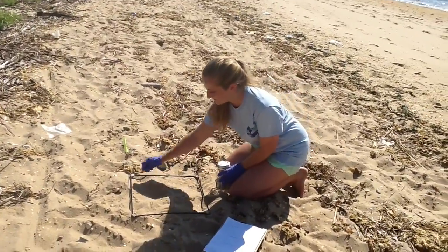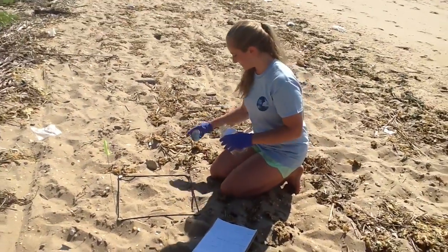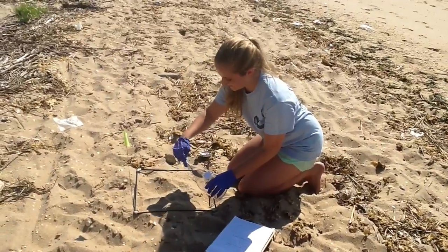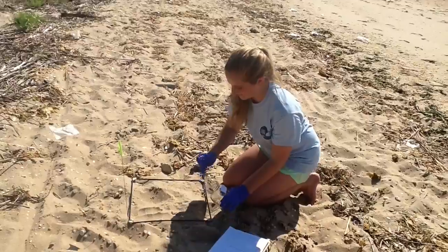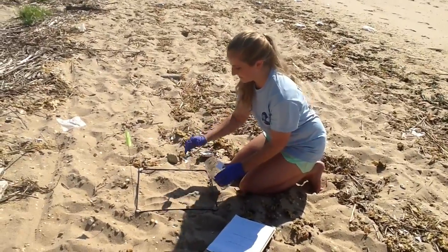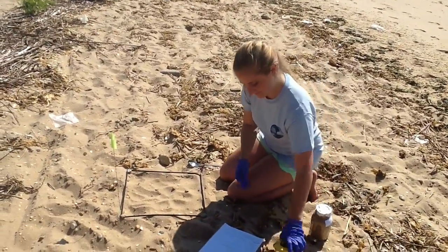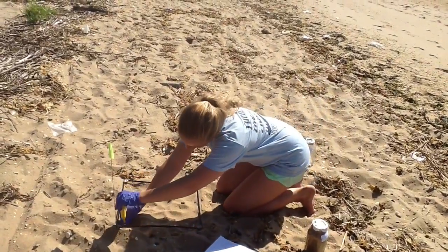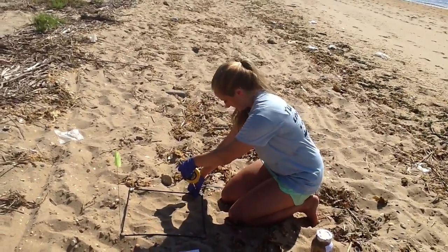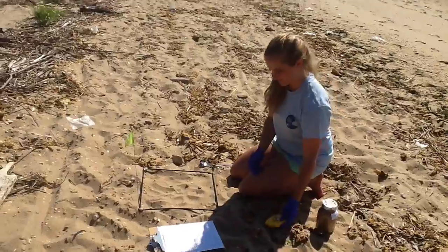Remember to record this information on your volunteer sampling data sheet. Verify the jars are appropriately labeled. To collect your sample, remove the cap from the collection jar. Using a metal spoon, remove the top layer of sand, which should be about two centimeters in depth, from the inside of the quadrat and place the sand in the collection jar. Continue removing sand until the jar is full. Remember to put the cap back on the collection jar. Now use the ruler or tape measure to measure the depth of sand that you removed from each corner and the center of the quadrat to the nearest millimeter. This should give you five measurements, which you should then record on the volunteer sampling data sheet.